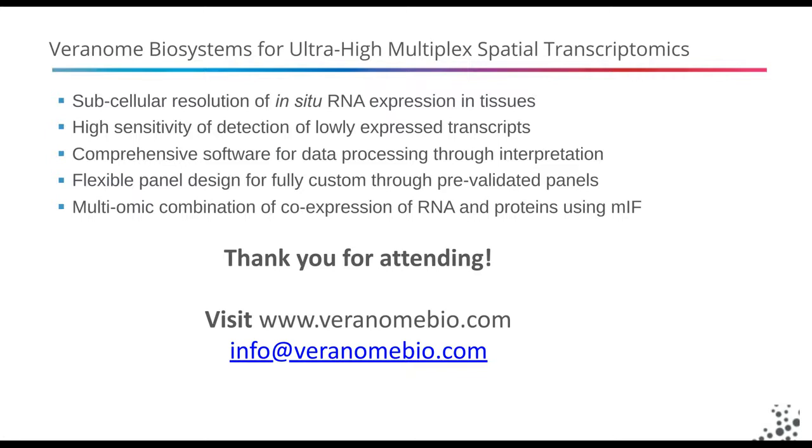Sure. So the overall experiment requires a fairly short amount of hands-on time to set up the individual assay. Once your tissues have been sectioned onto our slide, the overall bench time is a very quick process. There are some hybridization steps. Once the flow cell is set onto the instrument and the instrument runs, all of that portion is automated.